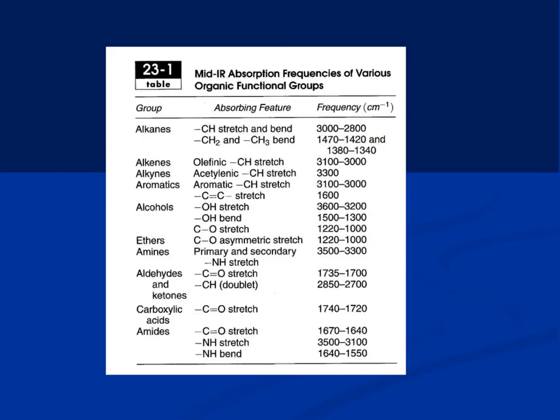So this technique tells us what kinds of vibrations are possible, and once we know which vibration absorbs which wavelength, then we can distinguish whether that particular group or bond is present in the molecule or the mixture you have. So if there is an absorbance of light at 3100, we can think that double bonds, alkenes, are present.